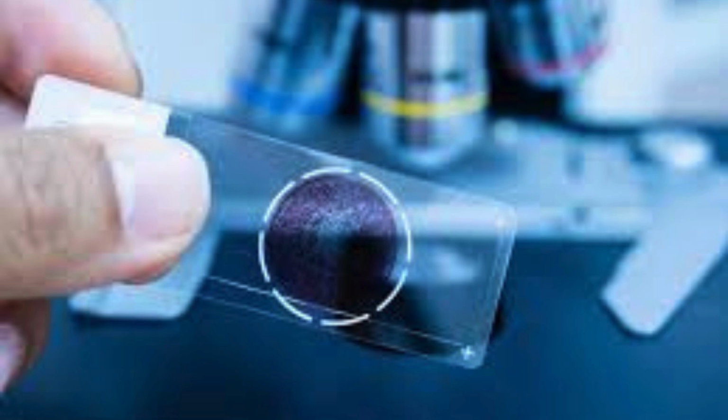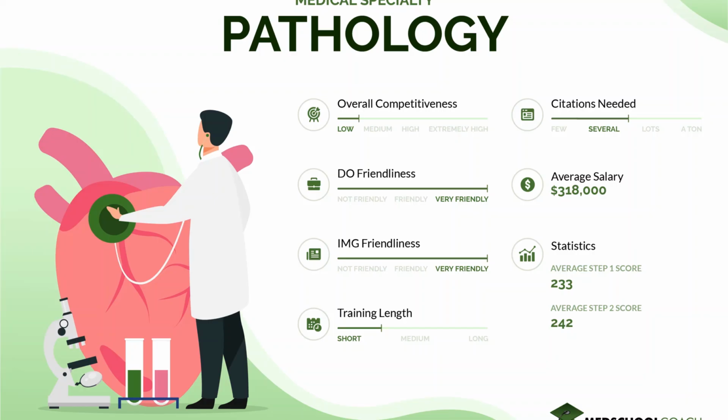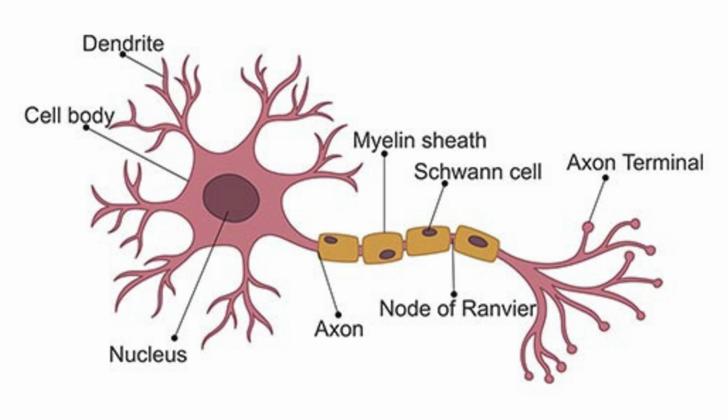Hydrophobic and hydrophilic interactions. Some stains adhere to hydrophilic materials such as proteins, while others interact with hydrophobic materials such as lipids. 3. Representative histological stains. There are many staining techniques used in histology. Each stain has specific characteristics and uses.